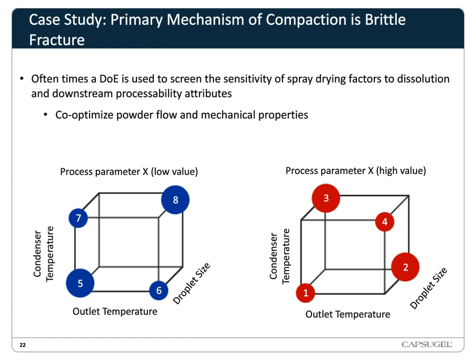Regardless, in this case, as in most cases, a spray dry DOE is done post-formulation lock. So the focus really is on co-optimization of powder flow, downstream handling, and mechanical properties. In addition, what we're really doing is looking for dissolution rate sensitivity at these different particle surface areas and morphologies. Now this DOE represents a general approach that investigates the impact of atomization and thermodynamics.